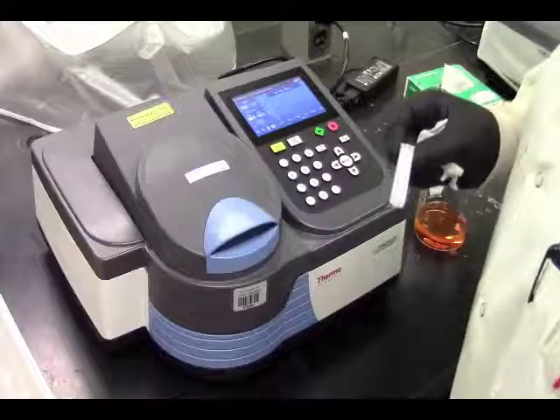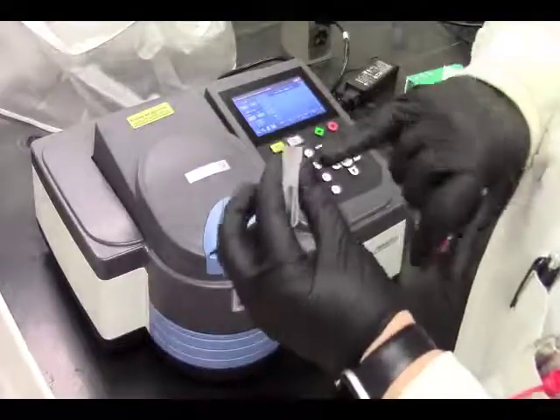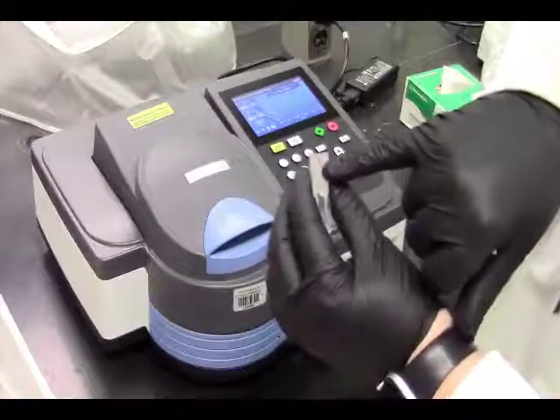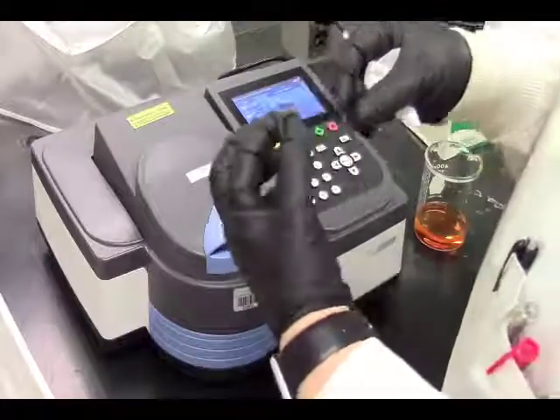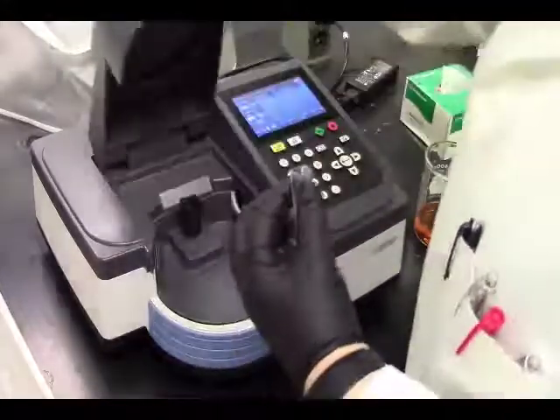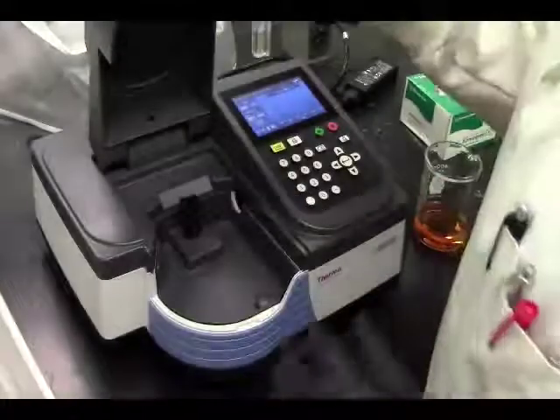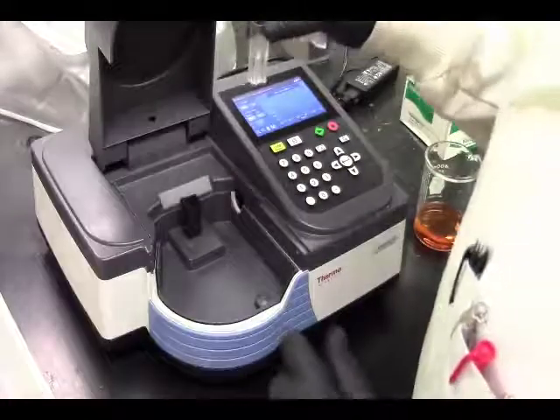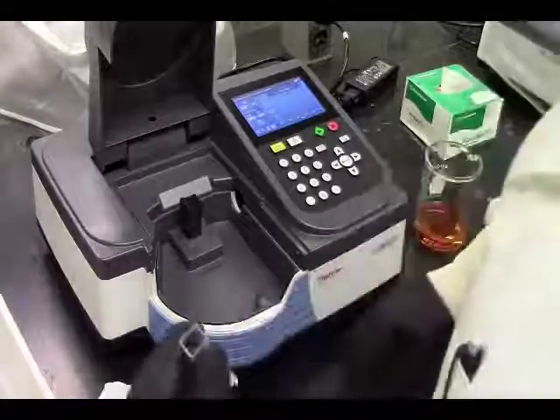Okay, we are back at the UV-Vis. Just so you can see it maybe a little clearer on camera, I've marked our V with red so you can tell where we're going to line it up. We are going to be lining it up with the V to the right every time. You need to be able to explain to me why you want to line your cuvette up the same way each time, because that's part of the technique.